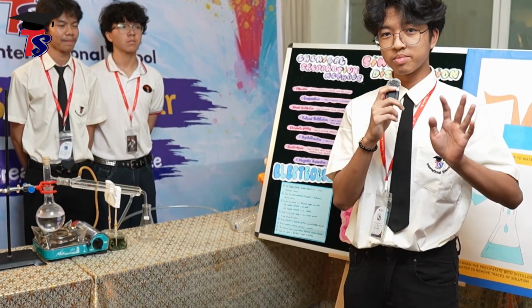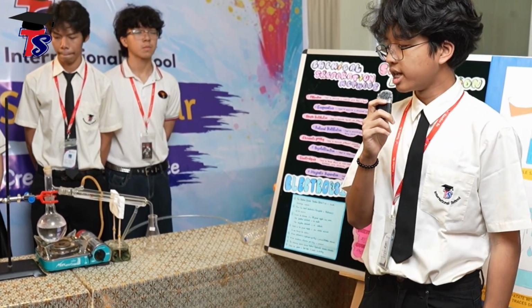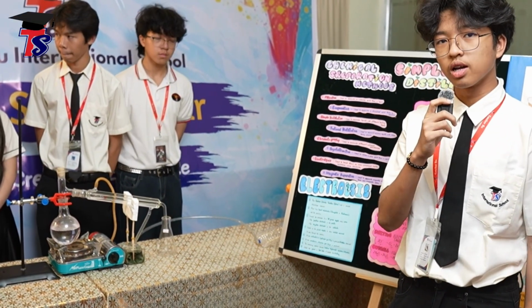Hi everyone, my name's Larry. So let's start with electrolysis. The first step we're gonna do is put brine solution, which is sodium chloride solution, into an electrolysis suitable container.